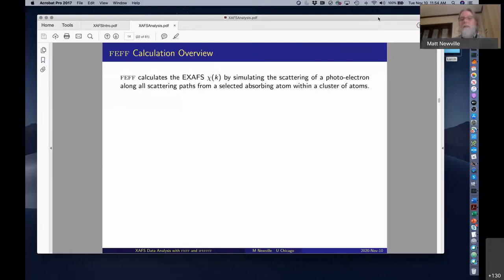It might be consistent with 0, but it might be important. It's also highly correlated with R. It's a phase term, so the third cumulant, the distance, and E0 are all correlated. You need to think about those together to be able to report the distance change well.